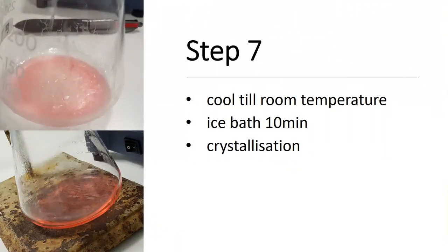Step 7. Allow the filtered benzoic acid solution and flask to cool to room temperature, then put into an ice bath to crystallise. Crystallisation is complete when the flask and its contents are cooled to 4 degrees Celsius, which should take approximately 10 minutes. Check the flask regularly because this time can vary.